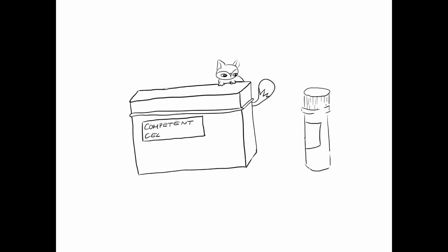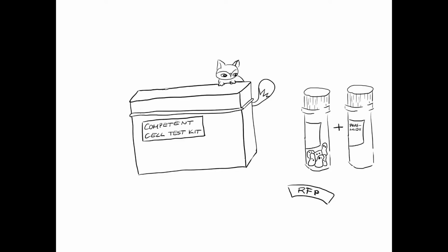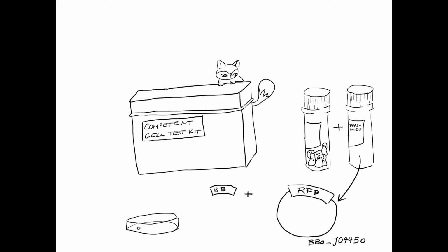Competent Cell Test Kit. These must be stored at -20°C. One of the most useful contents of the distribution kit that you will get is the Competent Cell Test Kit. You can use it to test and calculate the transformation efficiency of any competent cells of your choice.